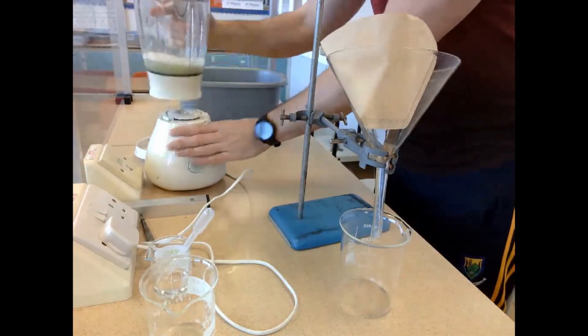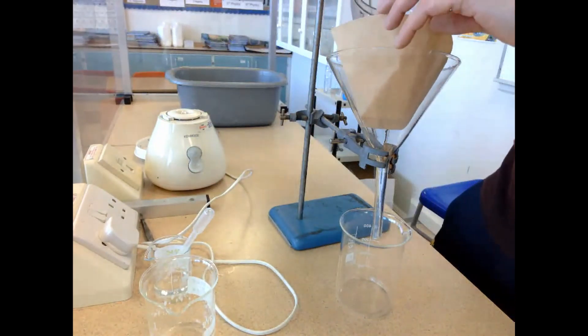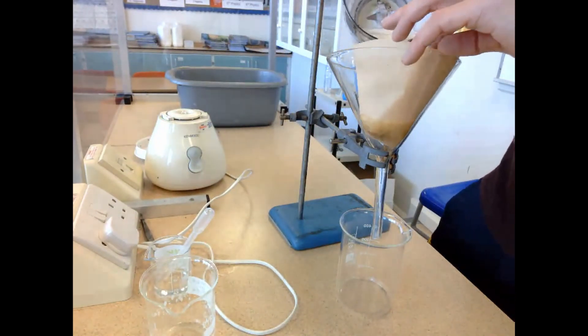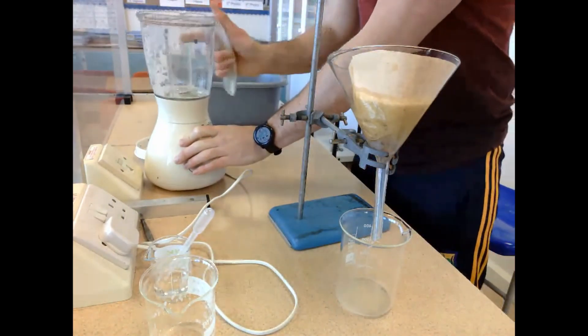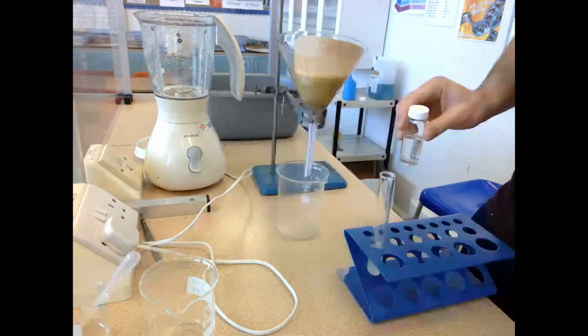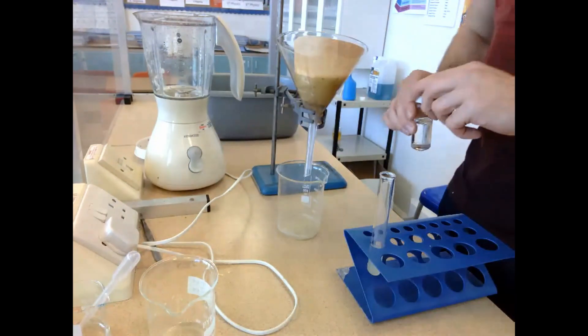So we take the blended solution, we pass it along into the coffee filter here and straight away this begins to filter out the solution. What we're going to do is we're going to capture some of this filtrate and add a few drops of protease to break down proteins associated with DNA. Now we don't actually have to do it as a kiwi because it produces its own protease.